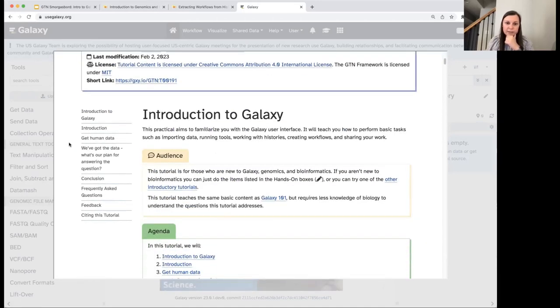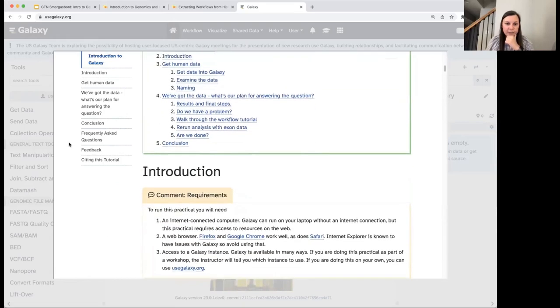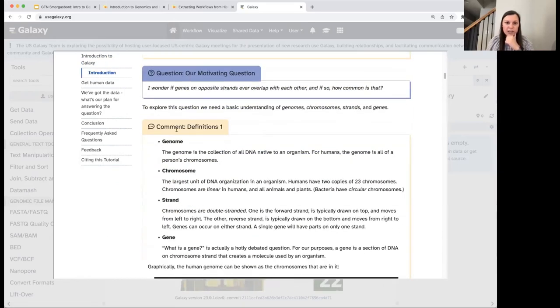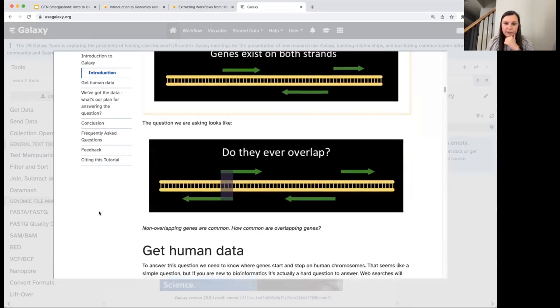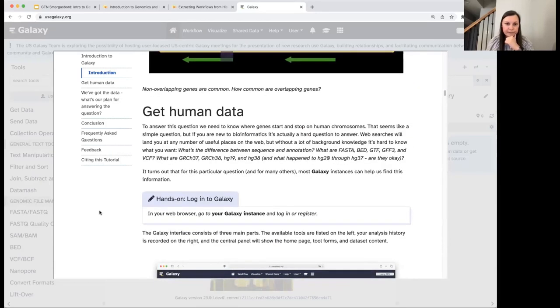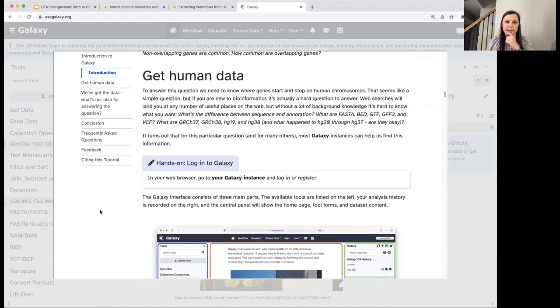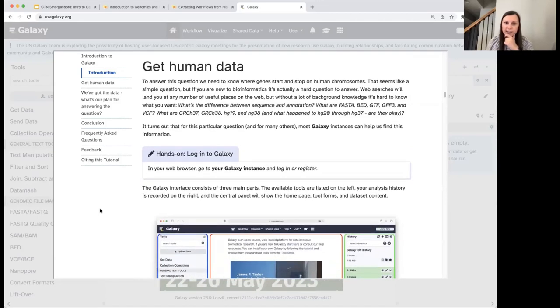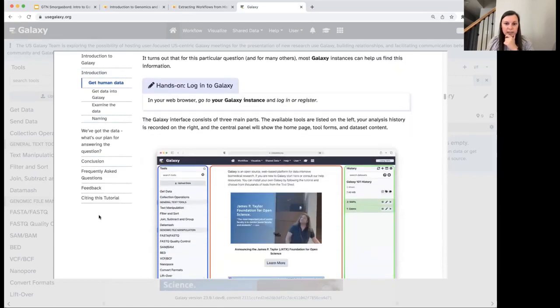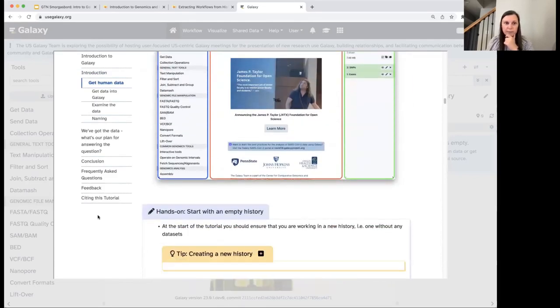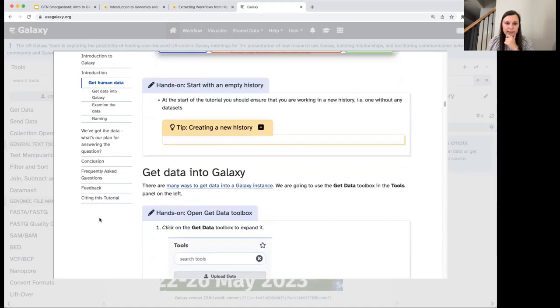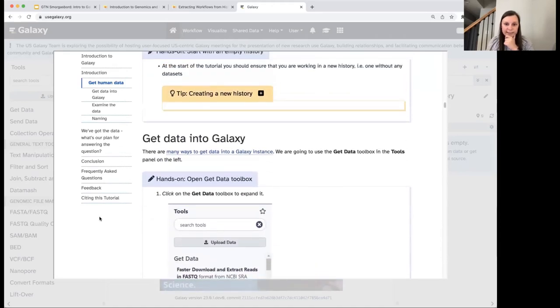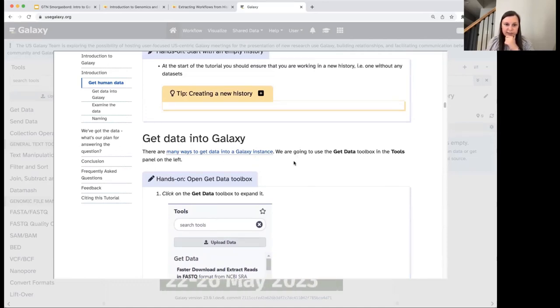I'm going to navigate to the Introduction to Galaxy Analyses topic, and select the Introduction to Genomics and Galaxy tutorial. This loads the tutorial in the same panel, remembering the place I was at. We covered the Introduction and the Motivating Question, some background definitions, and now we're at the step called Get Human Data.